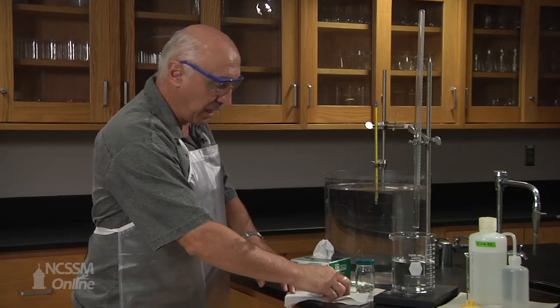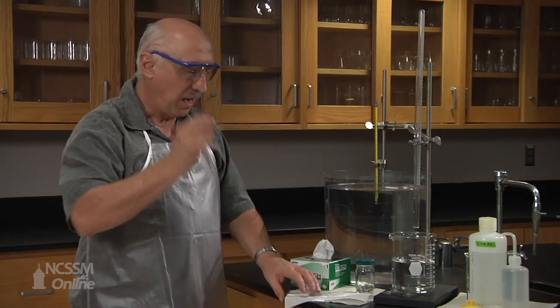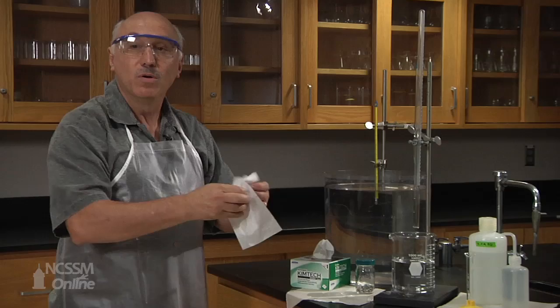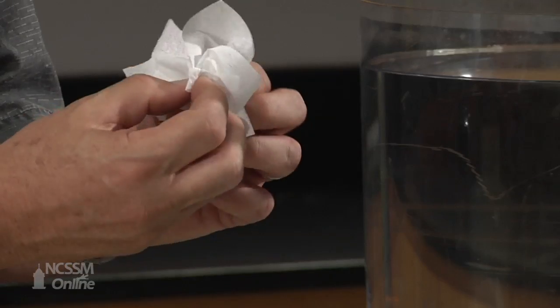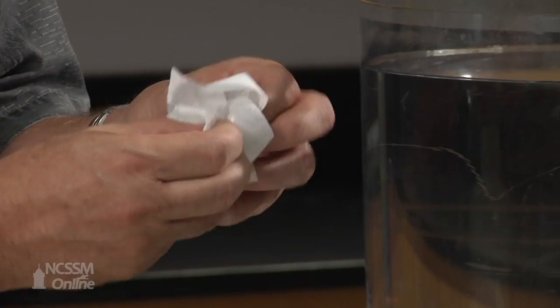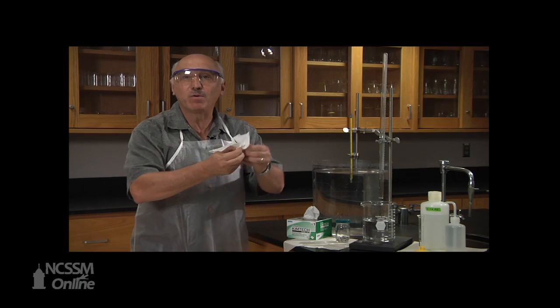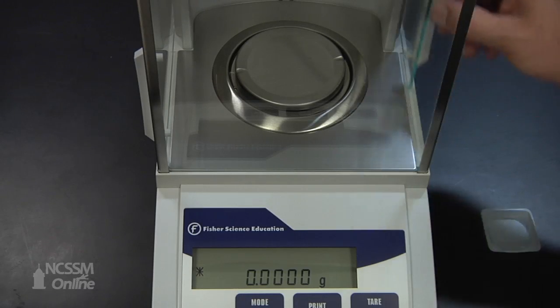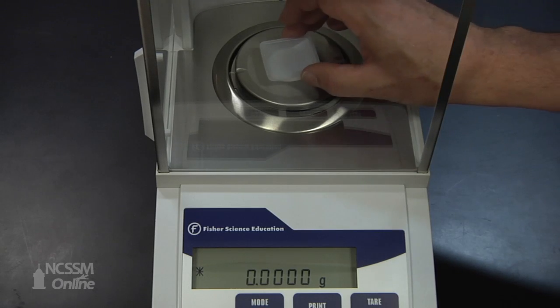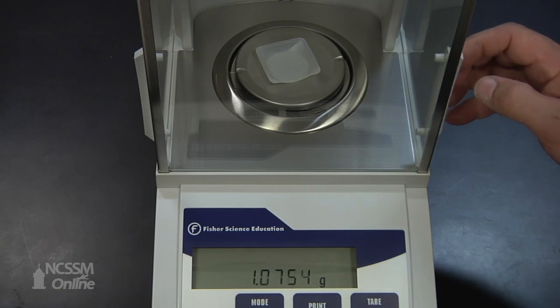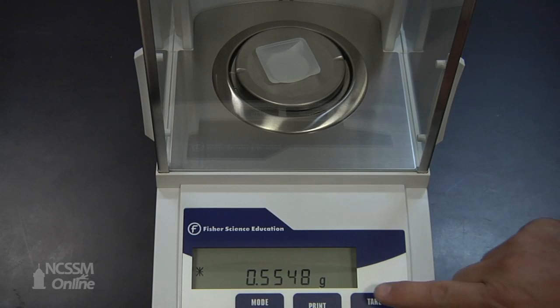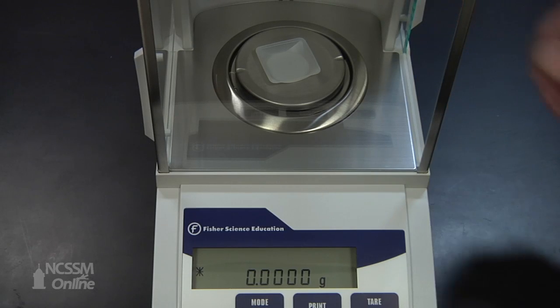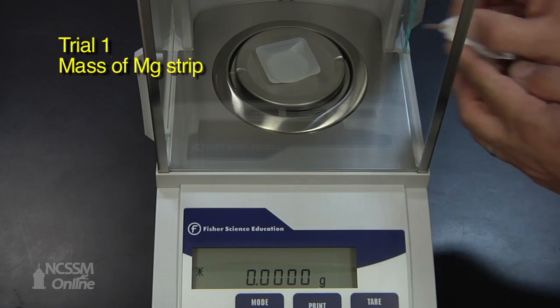The first step is we're going to take a magnesium strip and we're going to wipe it because we want to remove any finger oils that we may have before we mass it. So first we will tear the weighing boat and then we will weigh the first magnesium strip.